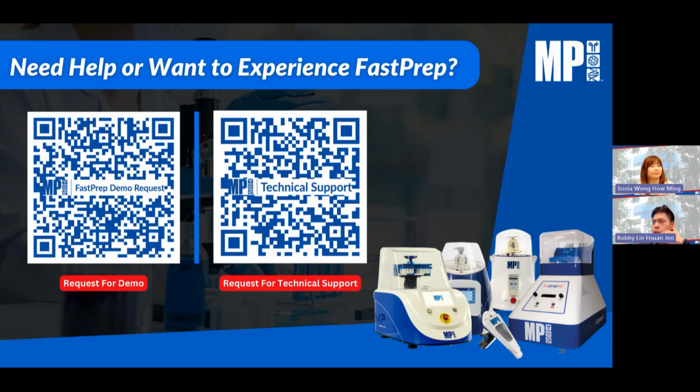Yeah, so Dr. Sonia, a lot of times this is more of a trial and error. I'm assuming that he or she hasn't done this sample disruption before. So we could start from a lower homogenization speed to test it further.